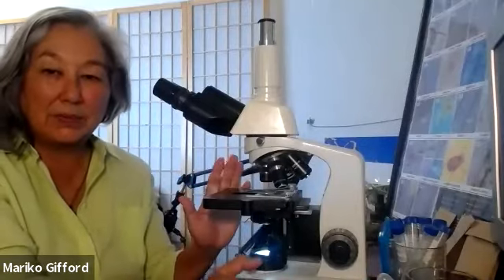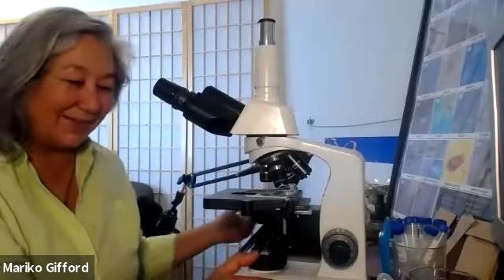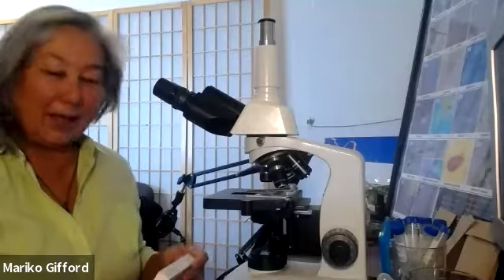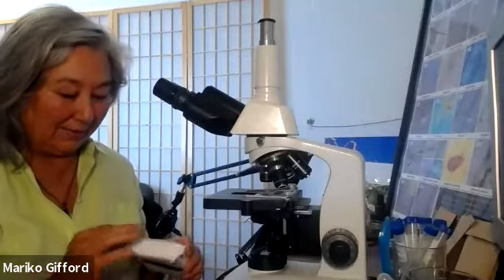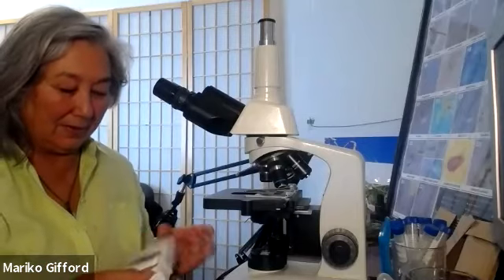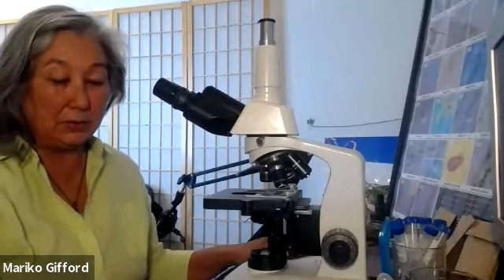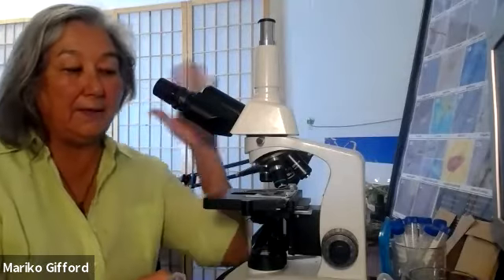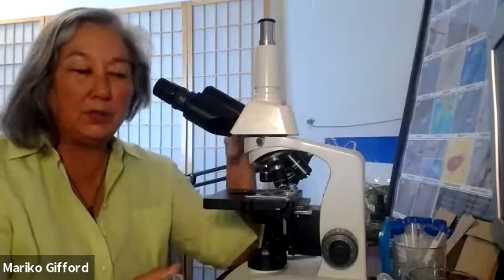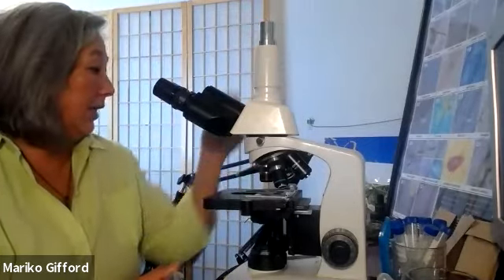Now, this is a cumbersome thing. It's hard to take this to the field. But it happens to be an easy tool that I just found out about, and I ordered it because I thought, what an amazing thing this is. And so you could find it, it's less expensive. This is about a $400 microscope, and on here I can also put a camera.